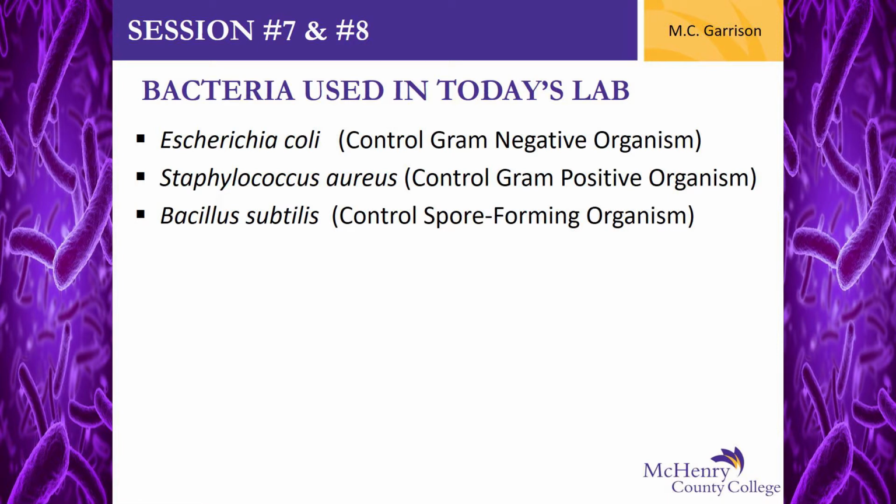Next, Bacillus subtilis, you actually did work with in your simple stains as well. If you remember, it was a fairly long, thick rod, in other words, a bacillus, that also forms spores. We saw some of those egg-shaped bodies in our bacillus smears when we did our simple staining. We did not stain it in the negative stain, but we did a simple basic stain of crystal violet and one of safranin, and we saw those hollowish egg-shaped bodies that Bacillus subtilis forms.